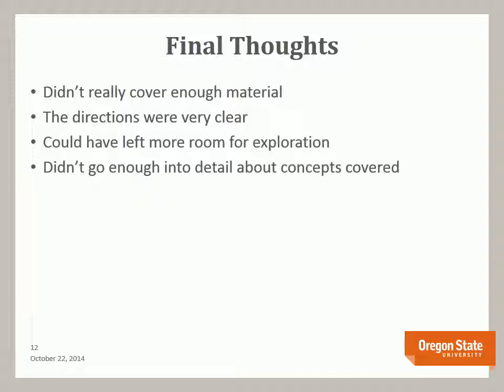I also thought the directions were very clear. However, it left no room for exploration in terms of why don't we allow the students to have this interface and add acid, heat for different amounts of time, see what happens, get fresh DNA samples, and do things in different orders. If you heat and then add acid and don't reheat, what happens?